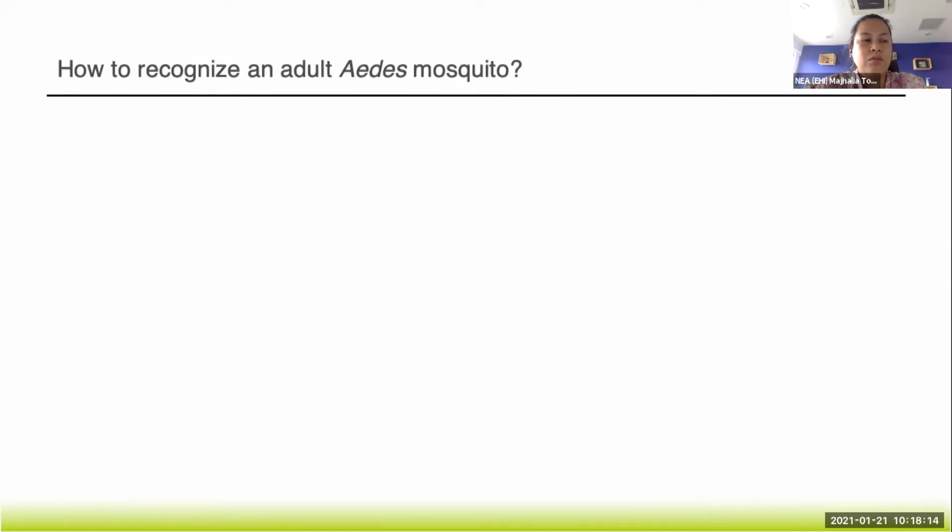Many mosquitoes do have spots on the legs, but not all of them. And also, some don't have any ornamentation on the abdomen, but some do have bands and other hair tufts or clusters of hairs in different parts of the abdomen. Body color and pattern is actually more important when you're zooming into species.